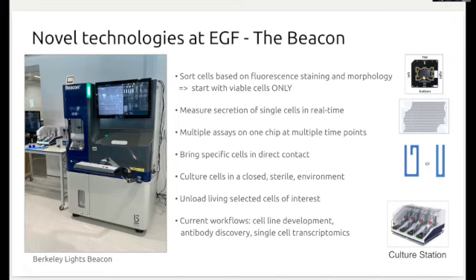Within that, there is a microfluidic channel, and attached to the channel there are pens, almost like wells, into which we can bring cells in and out using light and light capture. And then separately, we can culture the cells in a culture station as well.